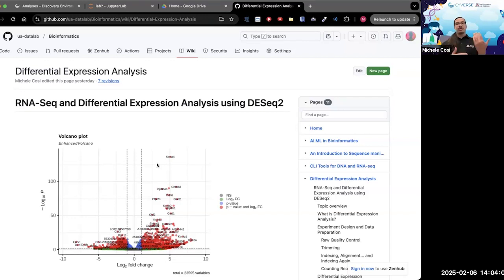Because I do not want to spend the entirety of today's lesson preparing the data, I have created and prepared the data for you if you do want to follow along, as well as installing DESeq2 and all of the libraries that it requires to run it on an application on CyVerse that we can use together in order to obtain some visuals from the differential expression analysis.